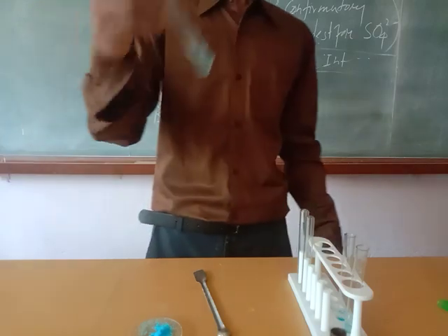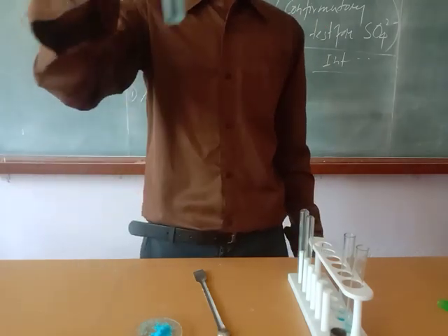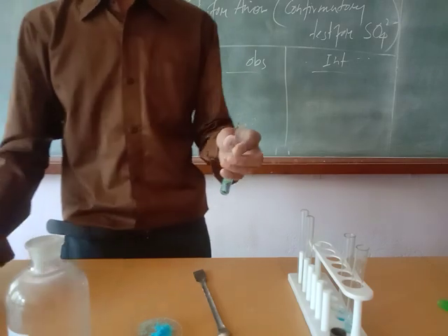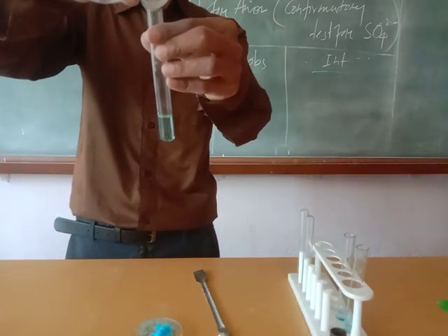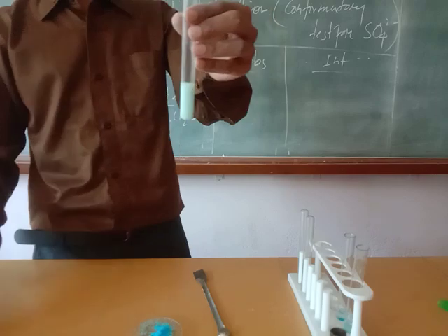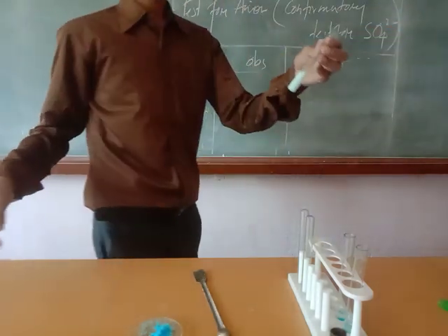Then dissolve the sample. This is our salt solution. The main reagent is barium chloride. Simply, you add barium chloride here. After adding barium chloride, some observation comes.